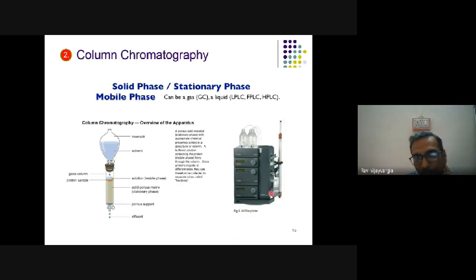Also, there is a spectrophotometer added in this machine. When the protein samples are eluting out of the column, they will go through the spectrophotometer, and in that, absorption at 280 nanometer is measured. So that also will tell you which fractions have high absorption, and that those fractions have a good amount of protein in them.